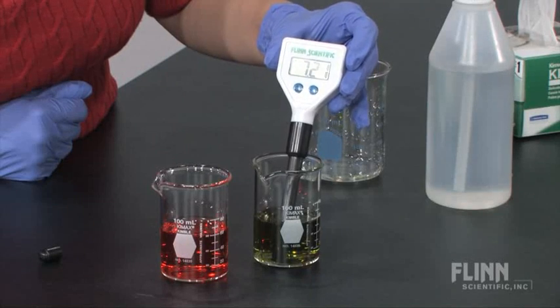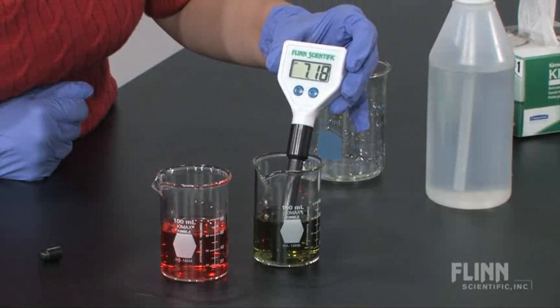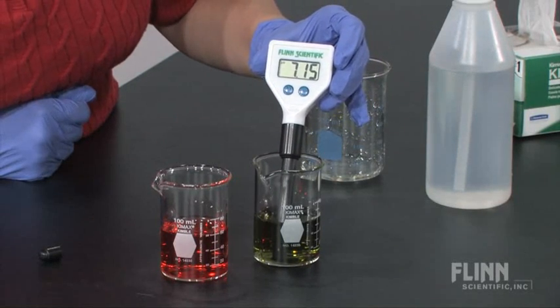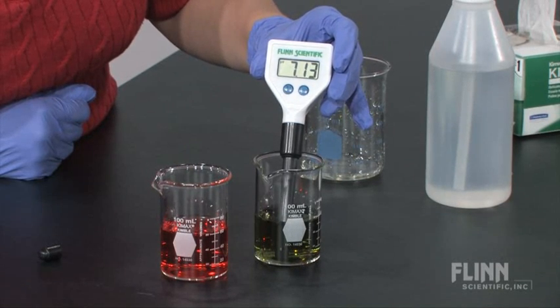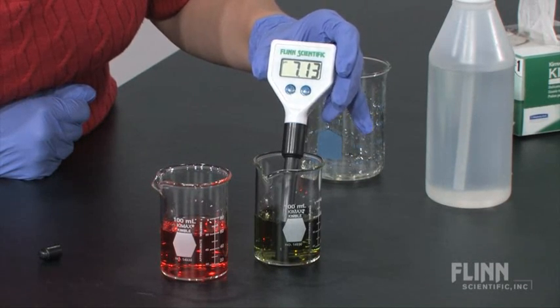The Flynn pH meter has a large, easy to read display and straightforward operation for easy data collection between 0 and 14 at a precision of 0.01 pH units.